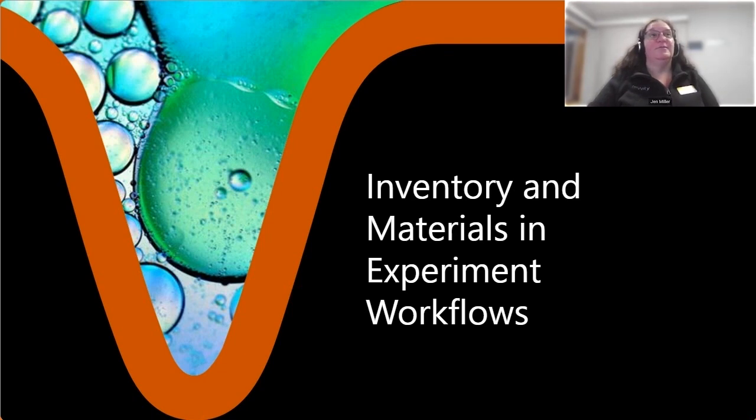Now that we've established a way to keep track of all sorts of materials, how can we easily integrate that into an everyday workflow? This is where we've taken a different path. In the next set of slides, I'm going to highlight the areas in the everyday workflow where we integrate from the experiment directly into the materials library and inventory rather than having the users log into another application.